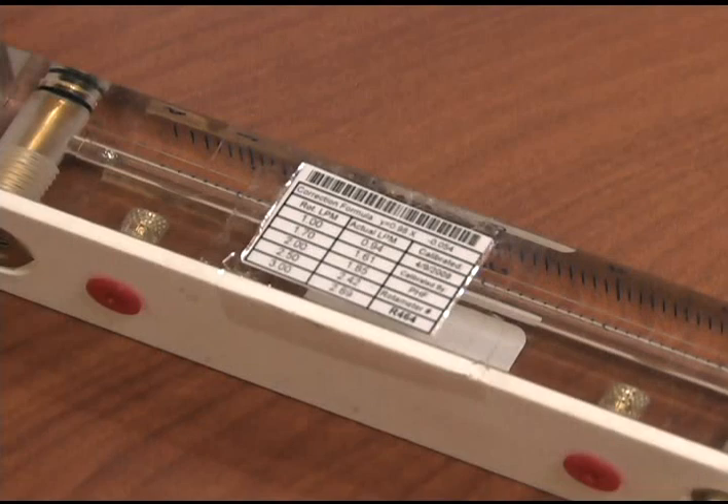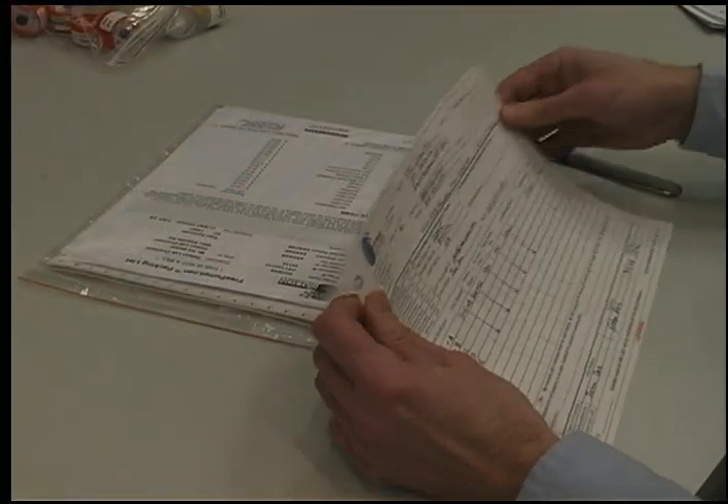All rotometers are calibrated against a primary standard every month. This calibration formula is located on the side of the field rotometer. Take the average rotometer reading and plug it into the calibration formula found on the side of the rotometer to determine your actual flow rate.